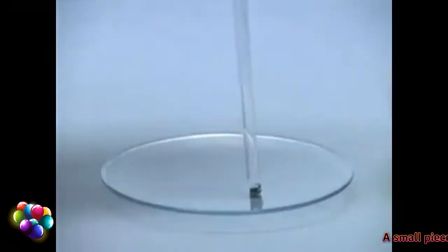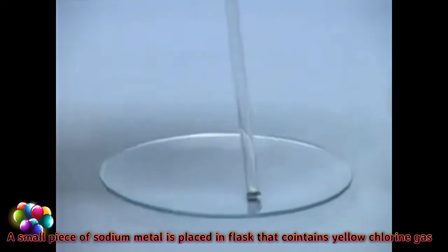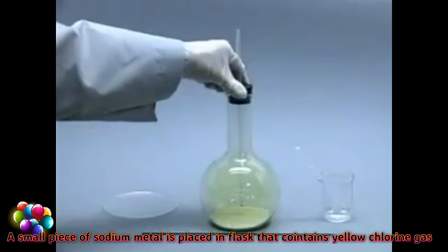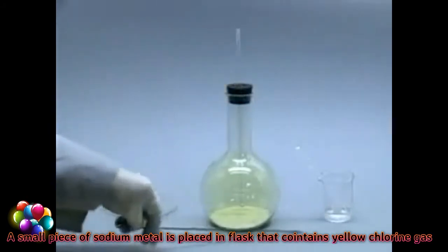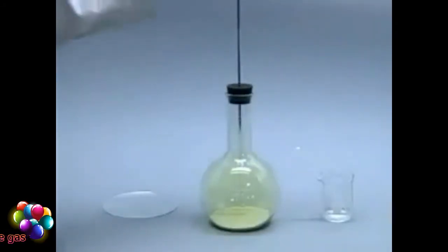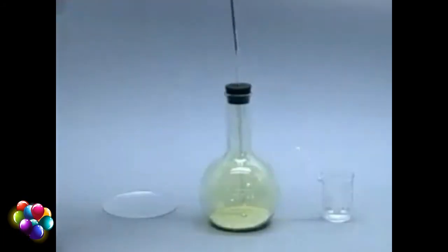A small piece of sodium metal is placed in a flask containing yellow chlorine gas. The flask also contains sand to prevent the heat which will be generated by the reaction from cracking the glass.